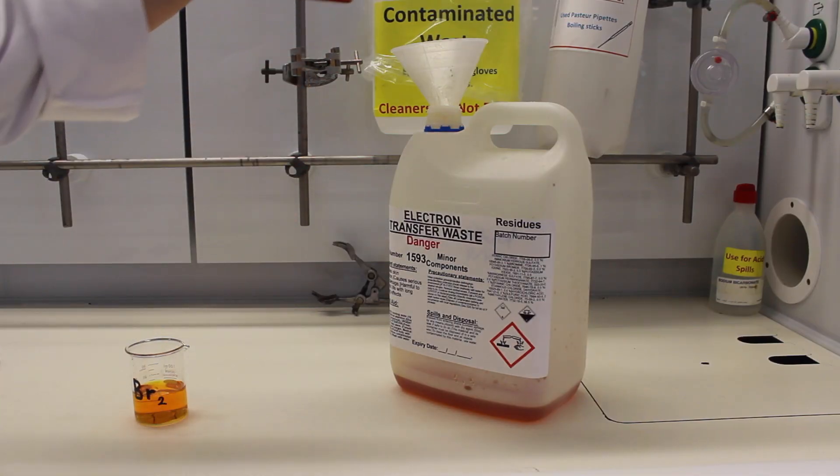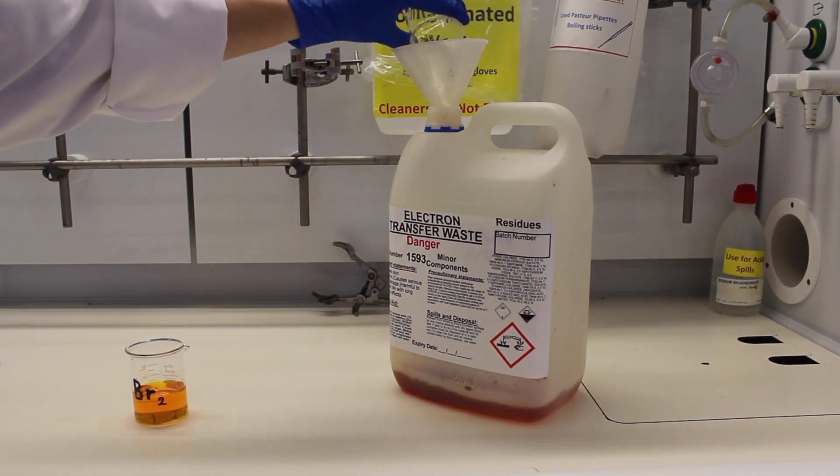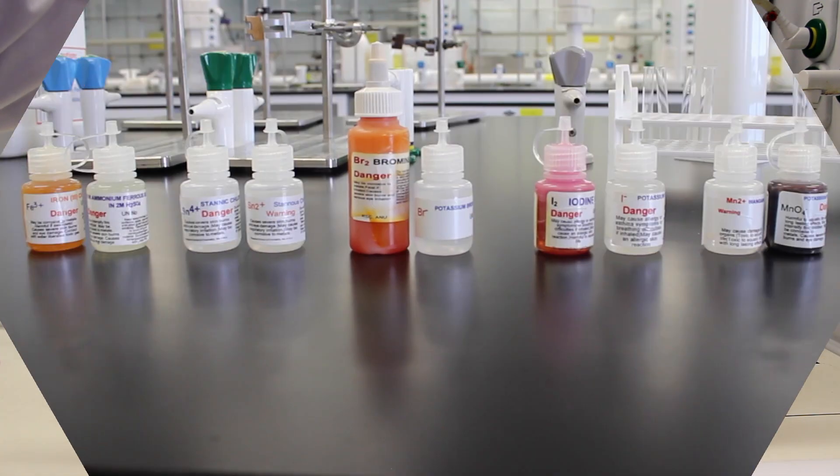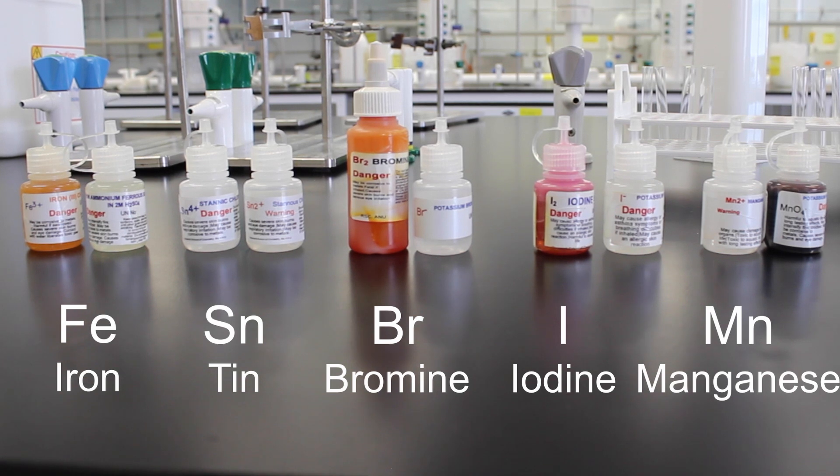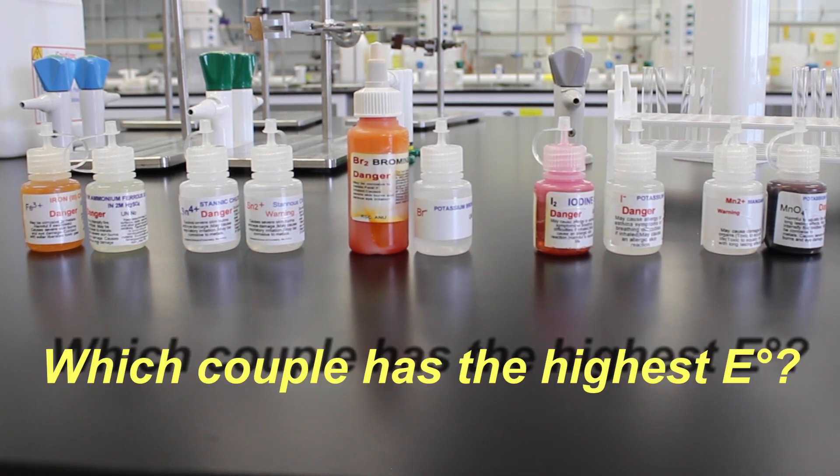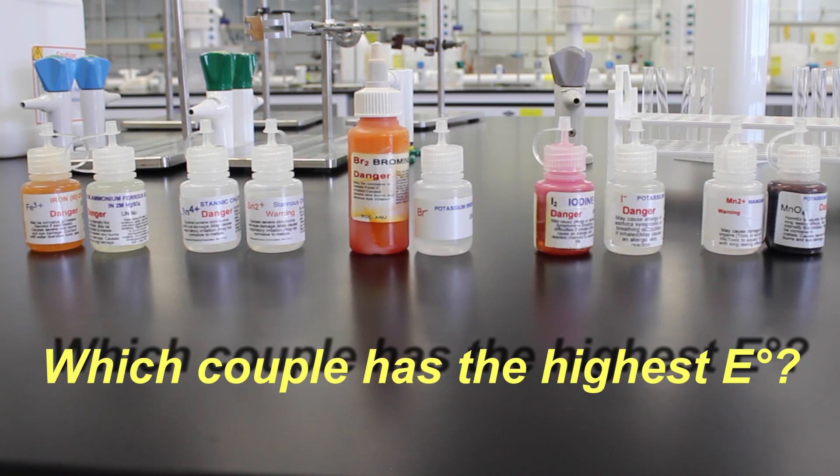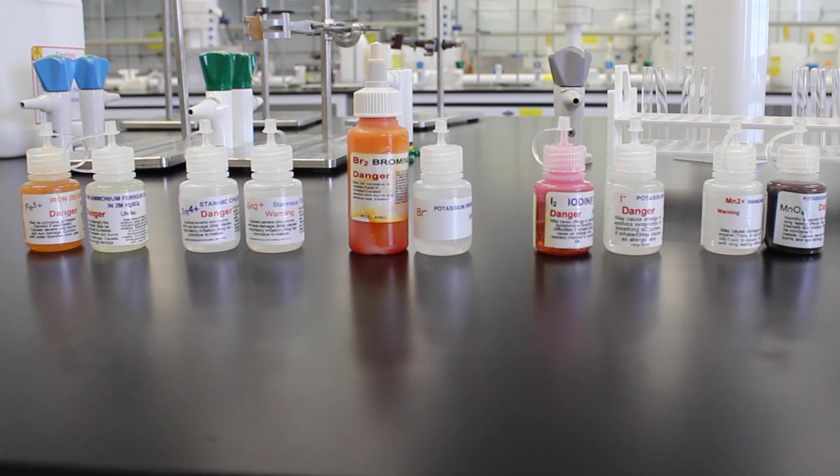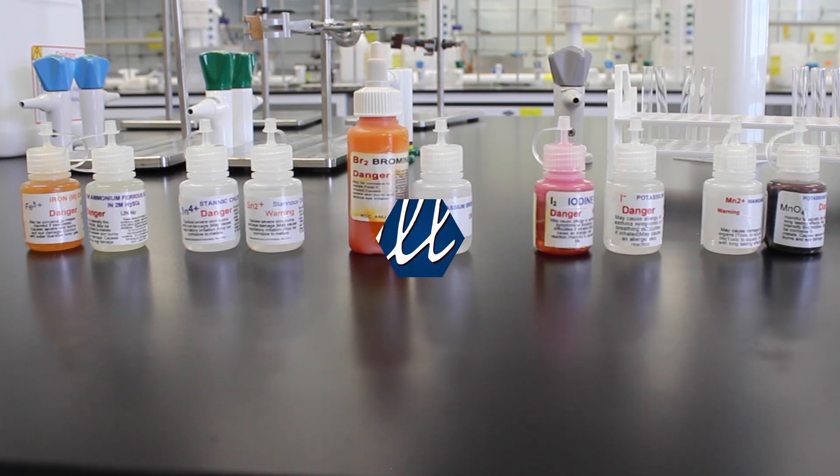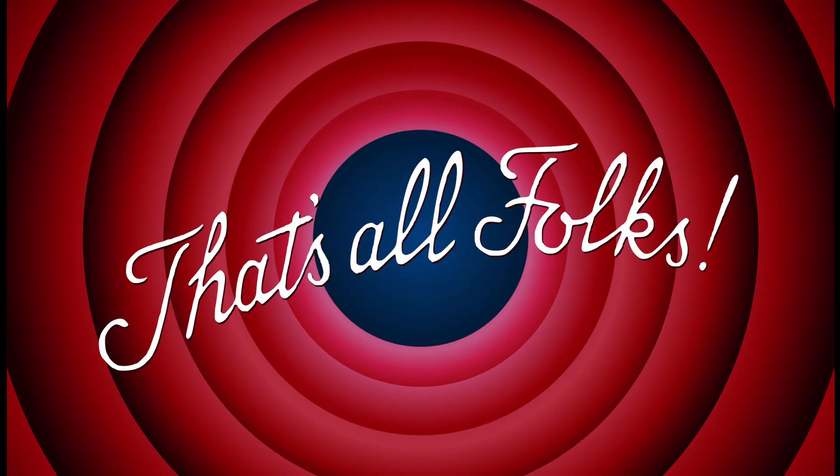Remember at the end of every lab to tip your waste into the appropriate waste container, making sure you read the label. You should now have enough information to rank the five couples that we studied today in order of their standard electrode potential. Keep in mind what the indicators we used were actually testing for, and think about whether that means a species has changed or stayed the same in its solution.